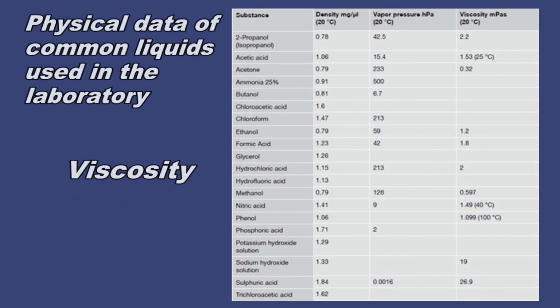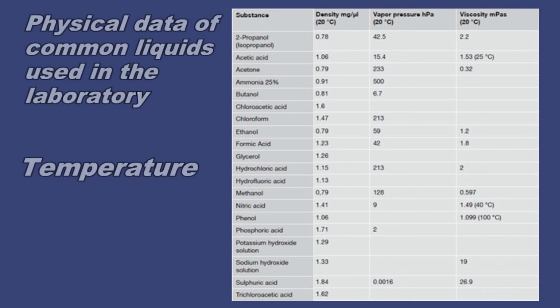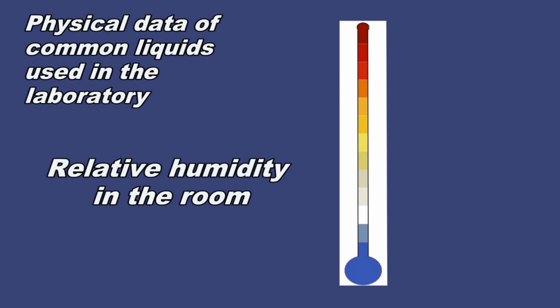Viscosity of the liquid. When pipetting viscous liquids, pre-wetting the tip is difficult and it tends to form droplets when dispensing. This may cause a considerable volume to remain in the tip. Use reverse pipetting. Changes of temperature between the pipette and the solution dramatically affect pipetting and dispensing. Changes in the ambient relative humidity affect the volume pipetted.